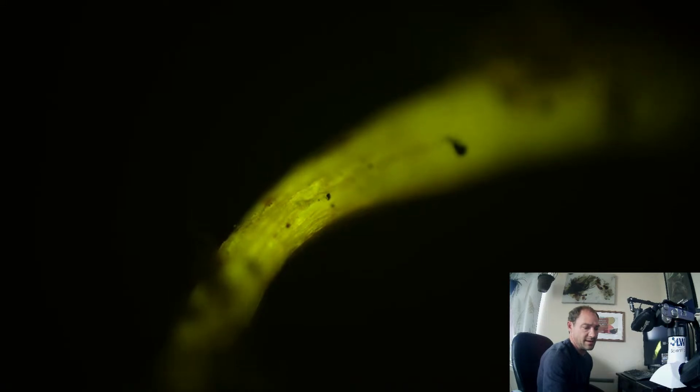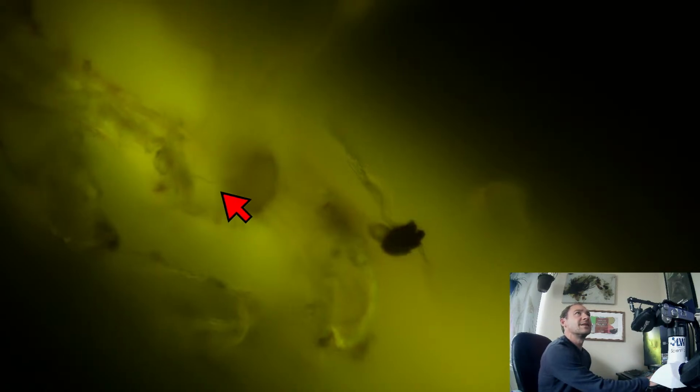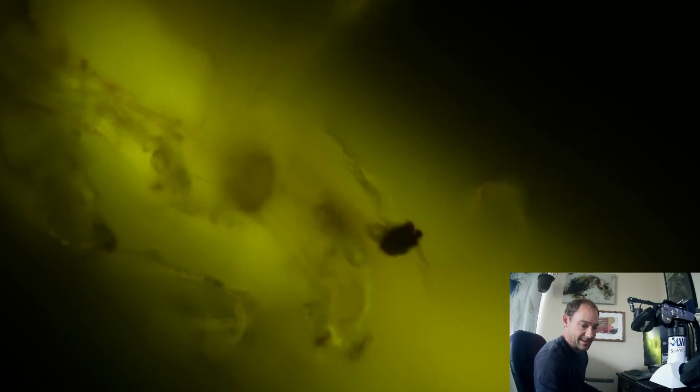There it is. Had to switch back out to 100, but there's a flat part. We should be able to get in there. See if we can focus on that without moving it. There we go. It's really hard to get good focus with a microscope on a three-dimensional object. Right there in the middle, that's definitely a little. It's hard to see. But right here you can see that's definitely fungi in this dandelion.